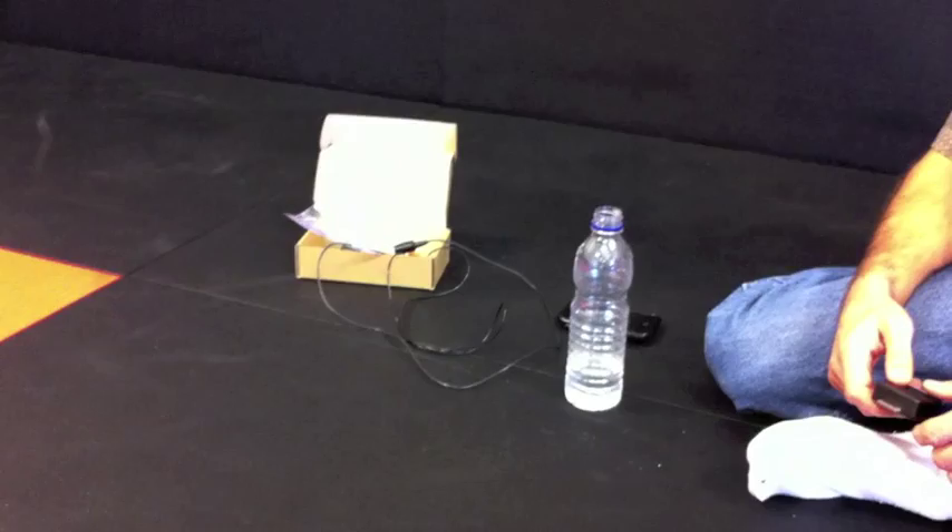Hey everyone, this is Rene from Tippie.com and I am here with Oric Miller of ODM Tech, and he is showing us a PH reader for the iPhone.